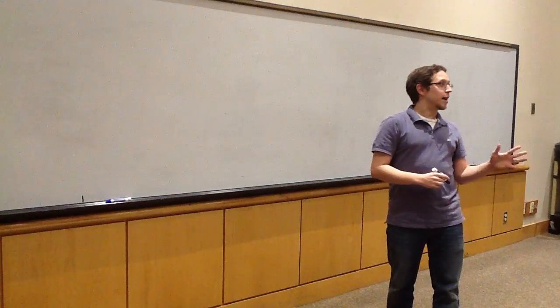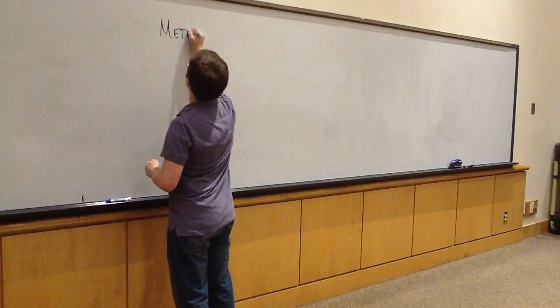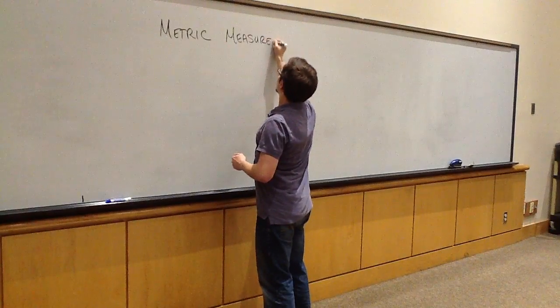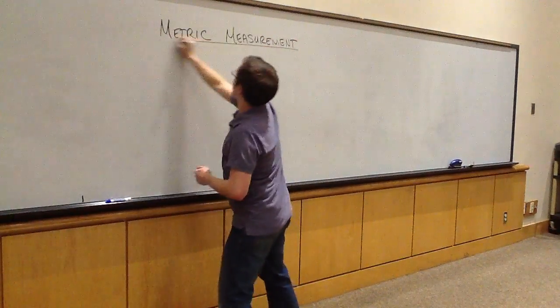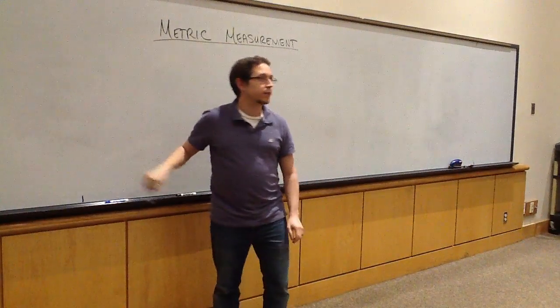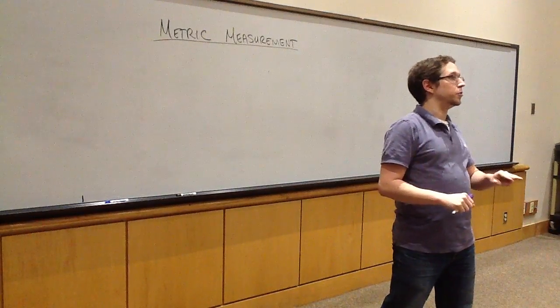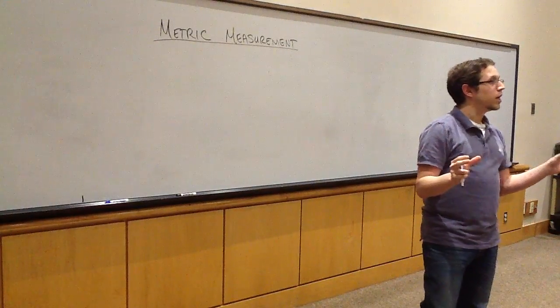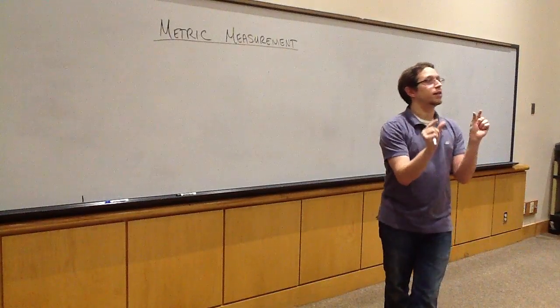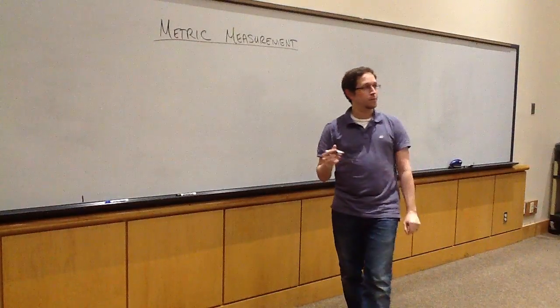So, that having been said, let's go ahead and get started with the first unit that you guys did, which was metric measurement. Remember that in this particular unit, we focused predominantly on the different units that we use, how to convert between those units, converting in those units into scientific notation. Then we had this nice, unique kind of volumetric conversion we learned, and finally we talked about temperature and the different pieces of lab equipment.